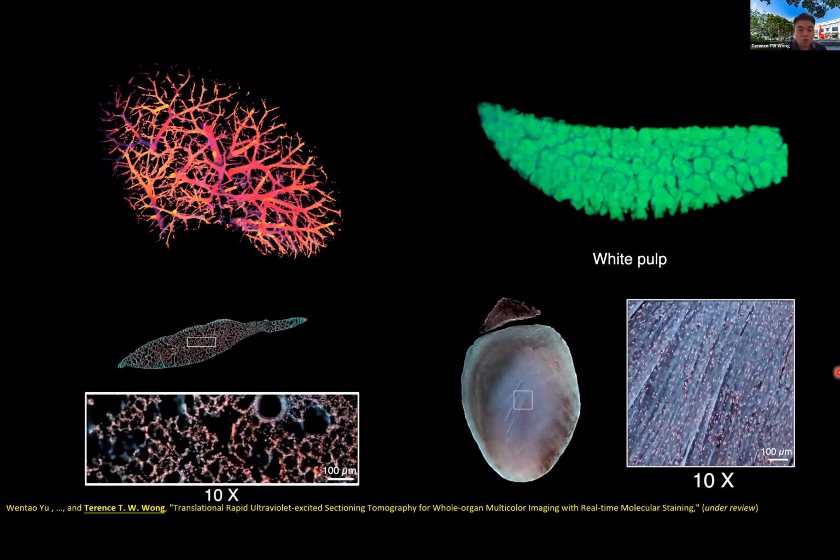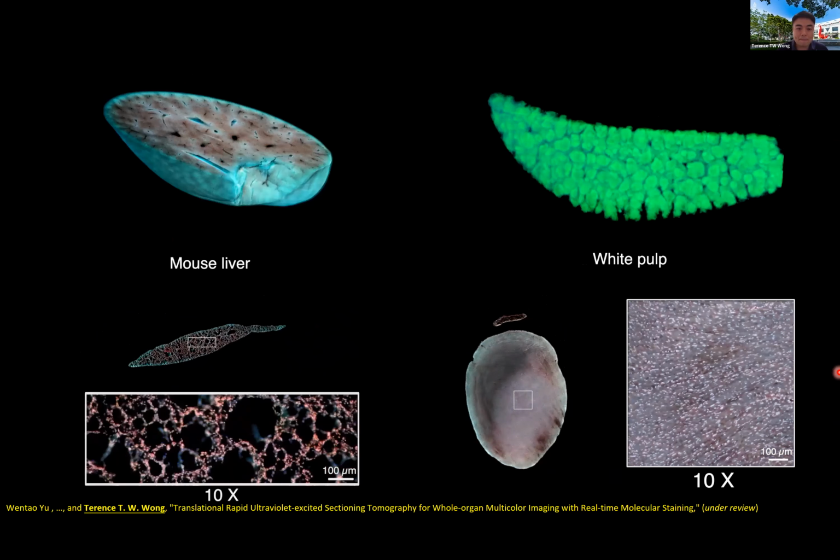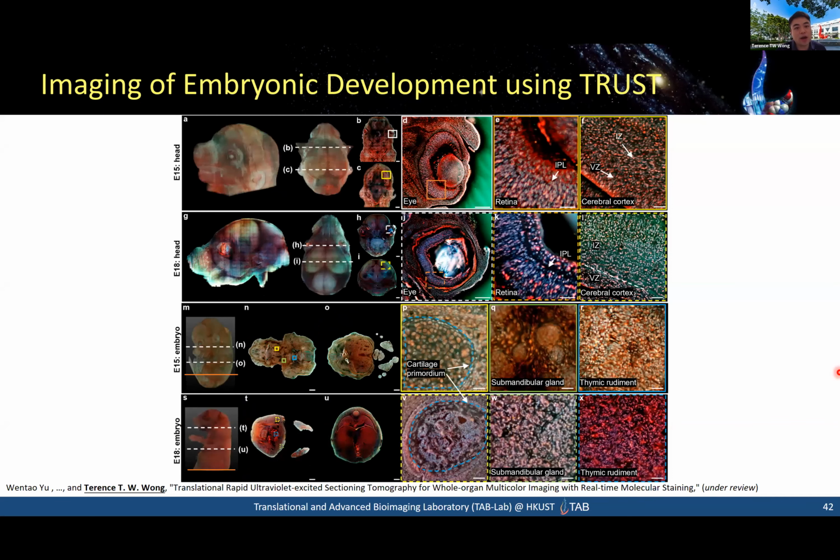Okay, so what's next? We also try to see not only soft tissues. For sure, we cannot cut bones, but for an embryo, the bone is still very soft. So we try to see if we can cut the embryo while it's still intact. I mean, the entire embryo is put into the Compresstome, and then we try to cut it as well.